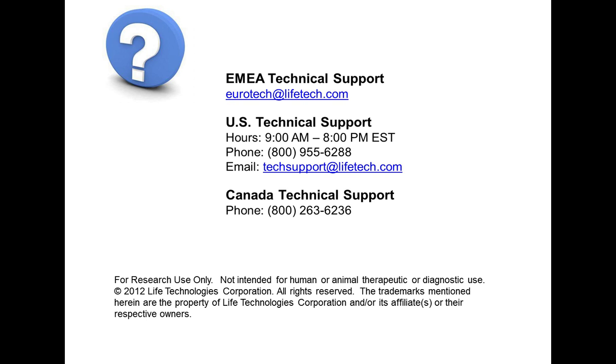So there's a question about what is the difference between side scatter A and side scatter H. This stands for area and height, so this is the difference between the area pulse and the height pulse. Most cytometers will have an area scaling factor to make sure that these are equivalent. For most applications of side scatter, it probably won't matter whether you use area or height. For fluorescence detection, if you're using a very bright signal for DNA content, you probably want to use an area fluorescence detector.